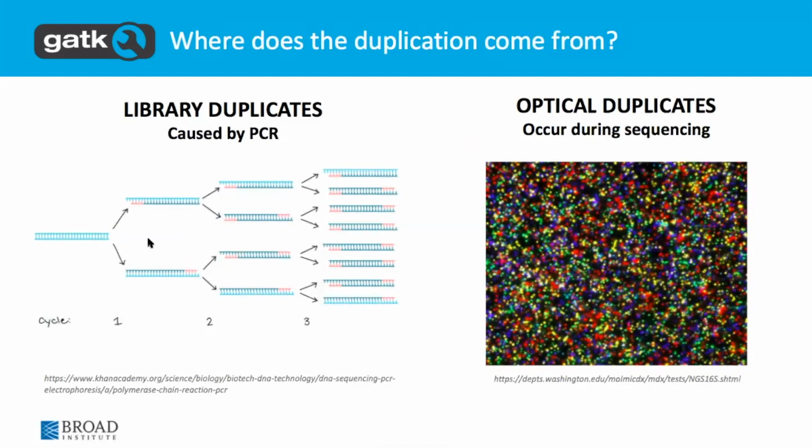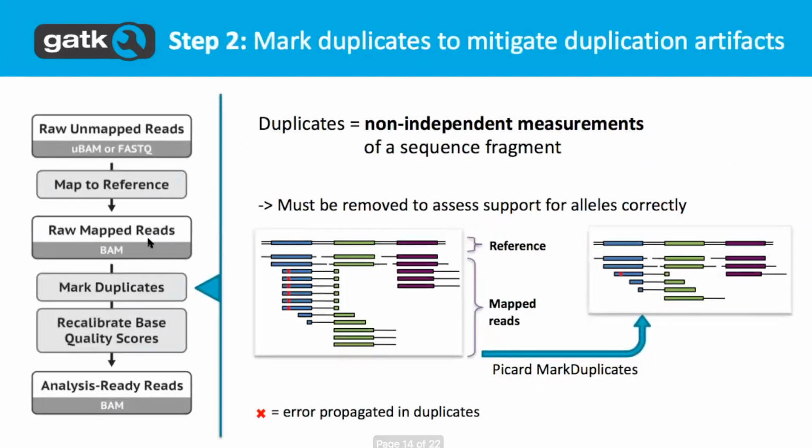And so how did these, yes? Go back to the duplicates. Do you recommend removing them as well if you have your sample split between two lanes, but based on the same library? When you add read group information, you do this separately for the lanes. So do you want to remove duplicates separately for each lane, or combine them and then remove?